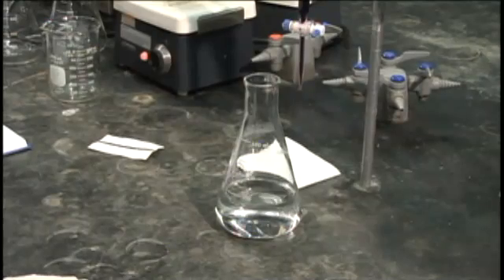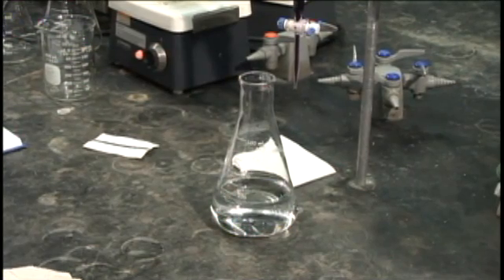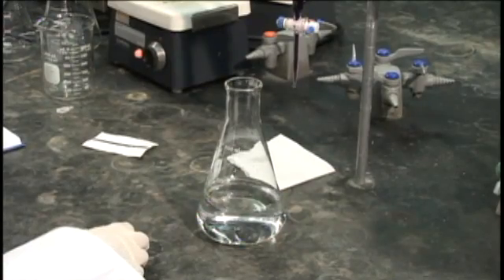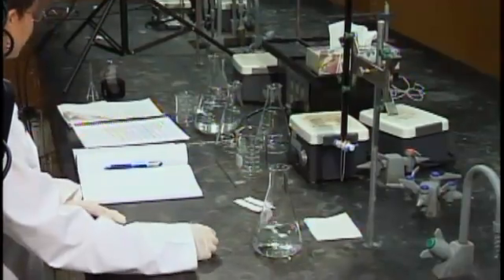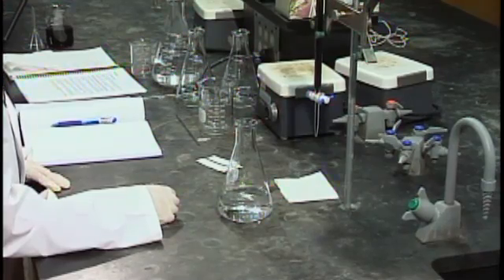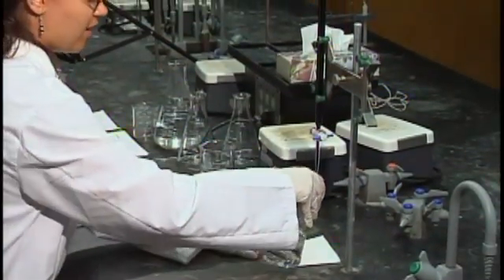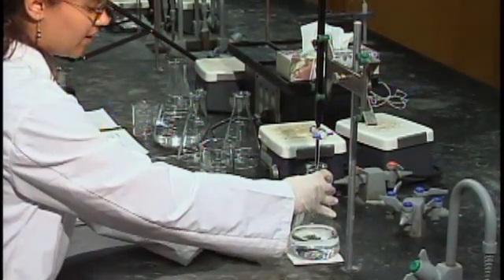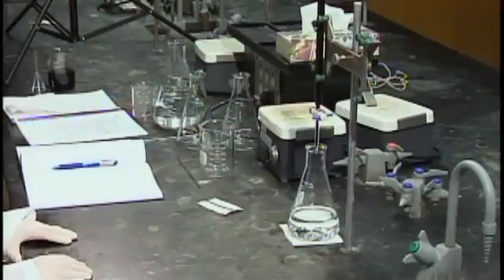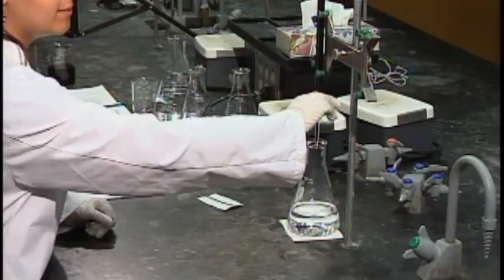So just to recap step 5, we added our 250 milliliters of 1 molar sulfuric acid to our sodium oxalate and swirled it or stirred it with a glass stirring rod until all of it was dissolved. In step 6, we're going to titrate our solution with our KMnO4. And we can quickly add our 90% consumption. In my case, it will be about 30 milliliters, but your calculation will be done in your pre-lab.